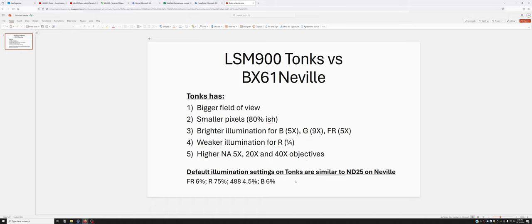The default illumination settings on Tonks are similar to the ND25 settings on Neville. The far red is 6%, the red is 75%, the 488 is 4.5%, and the blue is 6%. I picked these settings because they're similar to the ND25 settings on Neville, giving you a starting point if you're used to doing things on Neville.